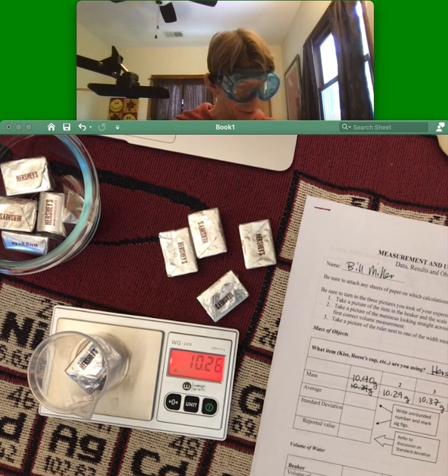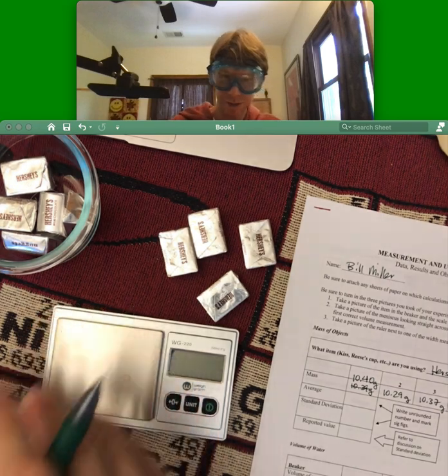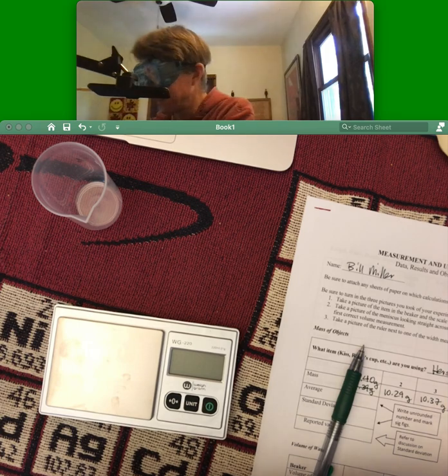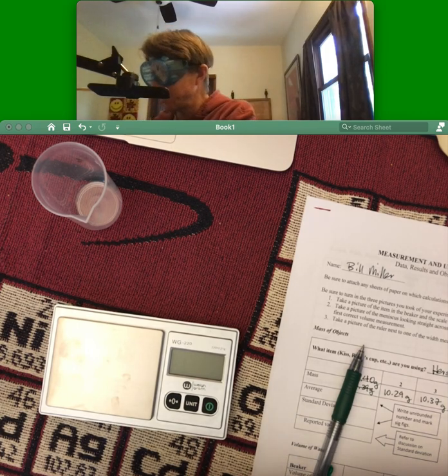And that's mass measurements down to number five. We can go ahead and turn that off. For these, since they're wrapped, I can put them back in their container for later.